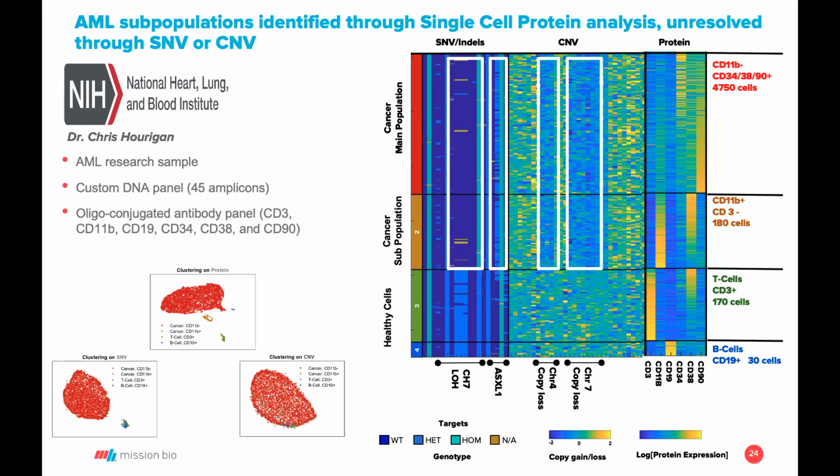Wow. So a follow-up to that, how do you assess the CNVs? Isn't the workflow PCR based? Yes, it is PCR based, but as I said, because we have information on the genotype, we determine what the control population is, and your control is part of the same sample. So we just normalize the amplicon signal against the normal population. So we start seeing the copy number changes.